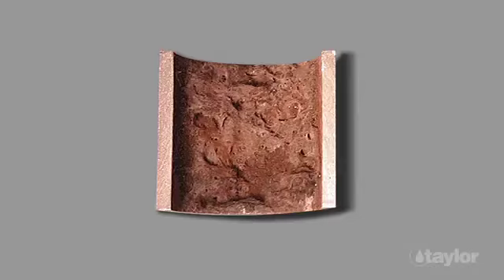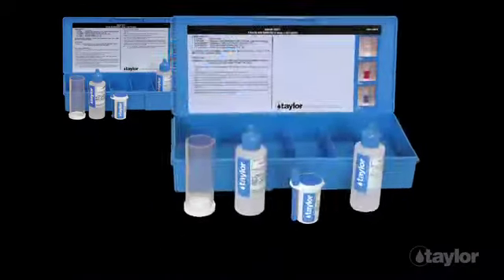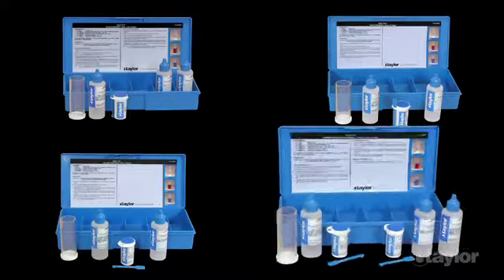For these reasons, calcium and total hardness are often tested in water to assure system reliability and water treatment program performance. It is critical to test water hardness on a regular basis, and Taylor offers several kits to help you monitor this parameter.